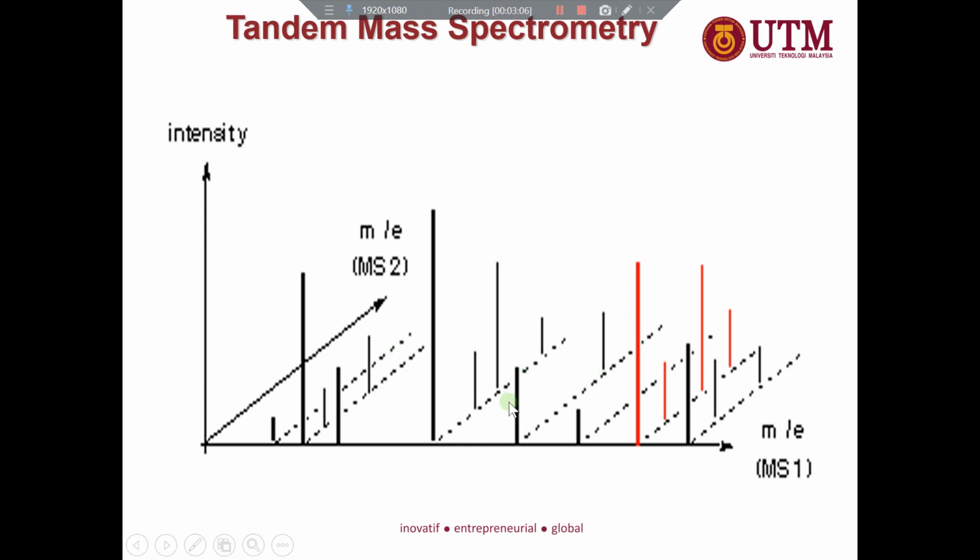Like this, when you take the moderate one, you may get just one. If you take a small one, you get nothing at all. But that's why you need to select a unique and also abundant one. The unique one and also the abundant one.